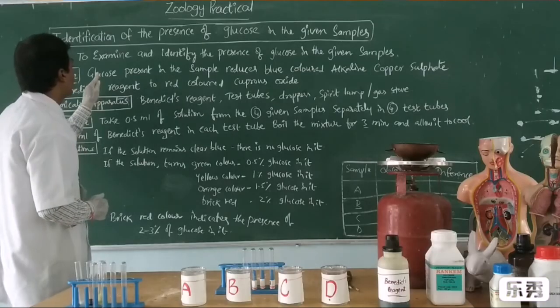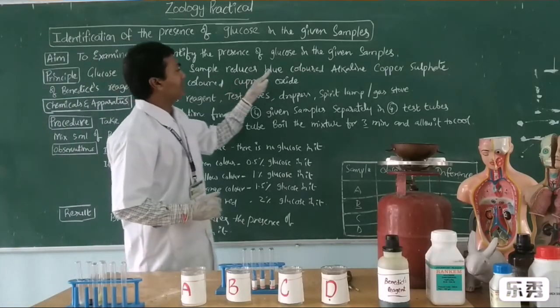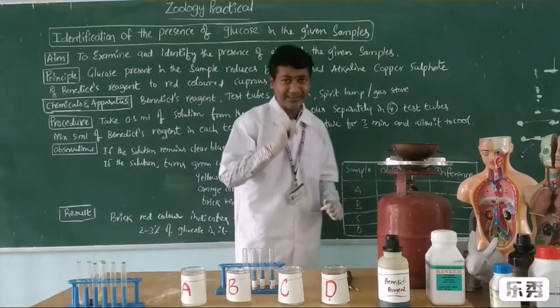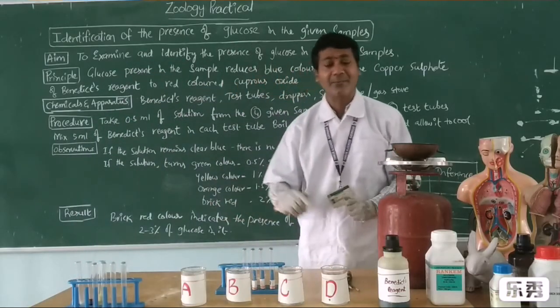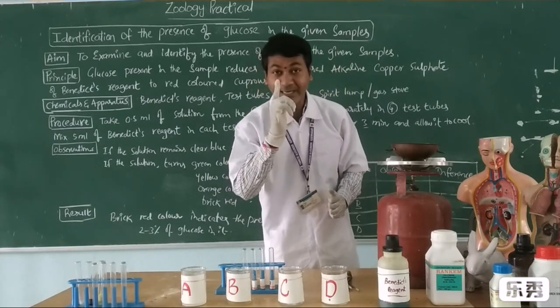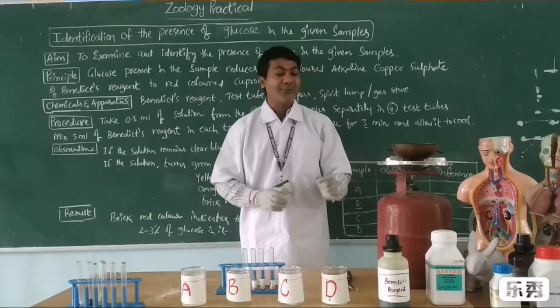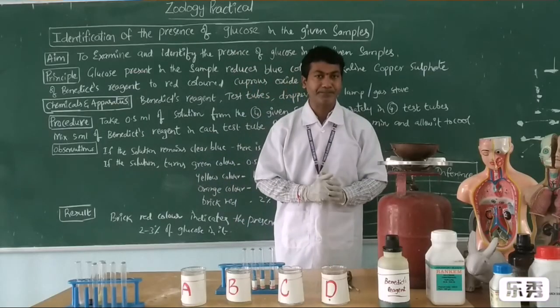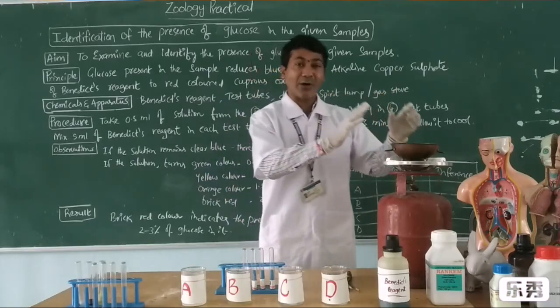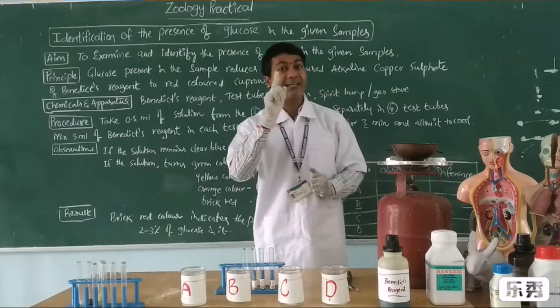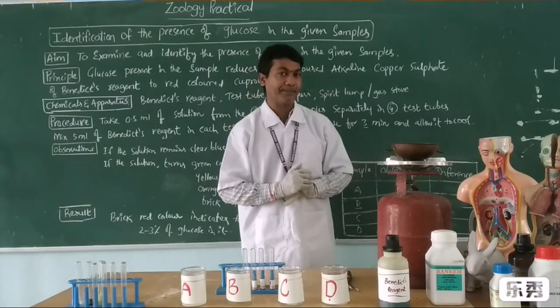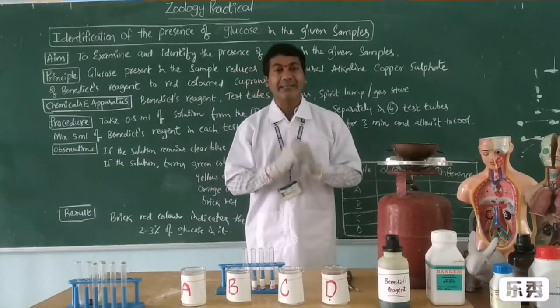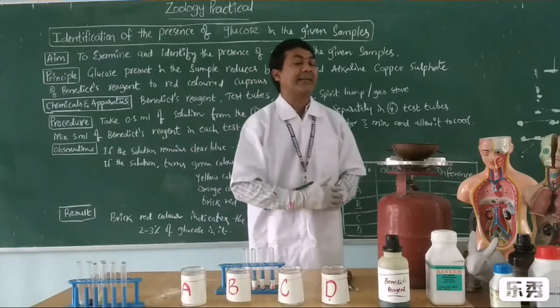The principle: glucose present in the sample reduces the blue-colored copper sulfate of Benedict's reagent. Here, to identify glucose from these samples, we use Benedict solution. Benedict solution is bluish in color. When you add Benedict to all the samples, all samples turn bluish. When heated on a water bath, if the solution remains blue, it indicates there is no glucose in the sample. If the blue-colored solution turns into red color, then that sample contains glucose.